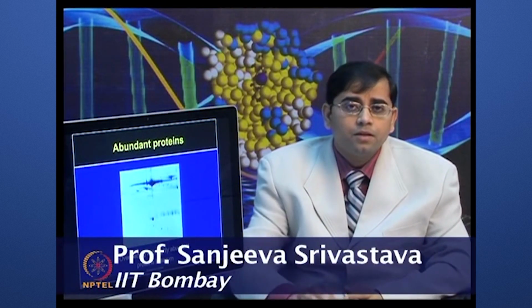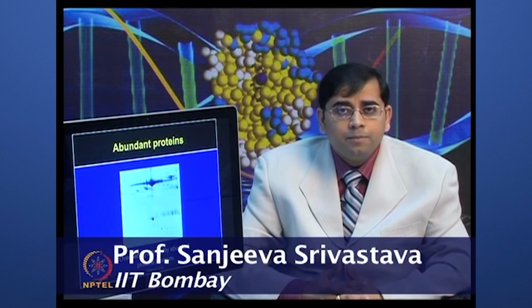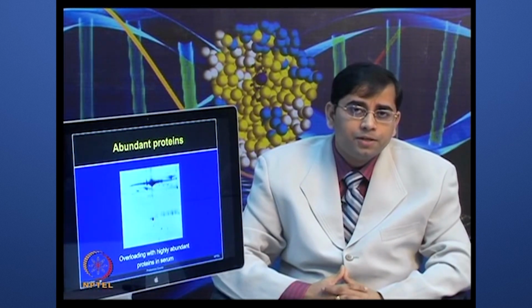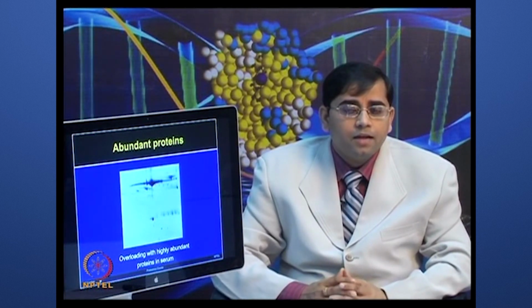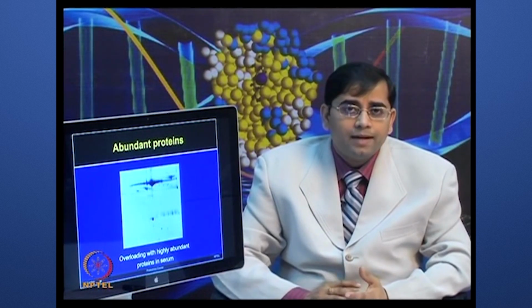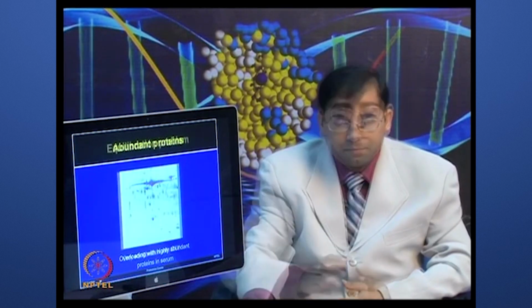In this gel, it is shown that the human serum protein sample contains highly abundant proteins, which are visible in this area. There are various ways one can overcome these limitations. In the previous class on protein extraction and sample preparation, we talked about how to remove the highly abundant proteins, so please refer to that lecture, and one can overcome this limitation.